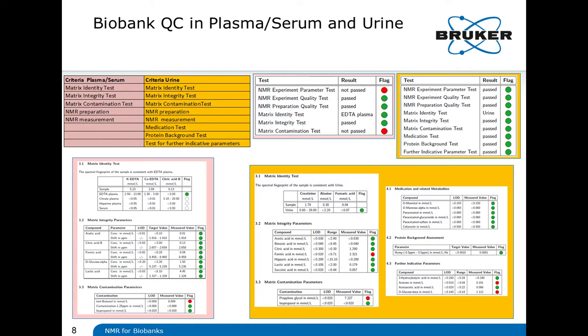So, of course, medication, for example, is quite important because it is well known that we have a lot of unreported parameters which might not be in the metadata. And of course, here there is a big help to immediately identify whether there is, for example, medication used. And then this would also explain outliers that you might have in any statistical investigation which is done afterwards.